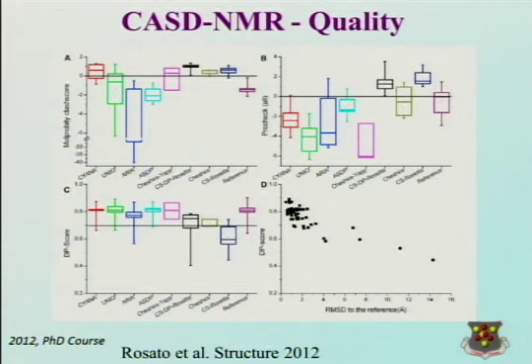But if your random coil locally has always the best possible conformation for that amino acid, you are getting exceedingly good quality, as here, but very poor agreement with the data. So even though I did not discuss data parameters today, I just want to give you the message that data parameters are very important, because if you don't look at the data, you don't get the right structures.